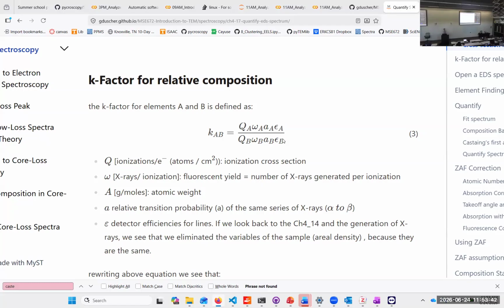You can be cheap if you have a high TC superconductor that you know is superconducting, right? Then you know exactly the composition, because BIPCO or whatever, BISCO, these compositions are very, very well defined, and then you know that the property is superconductivity. So if it's a good superconductor, you know your composition, and you just use that.